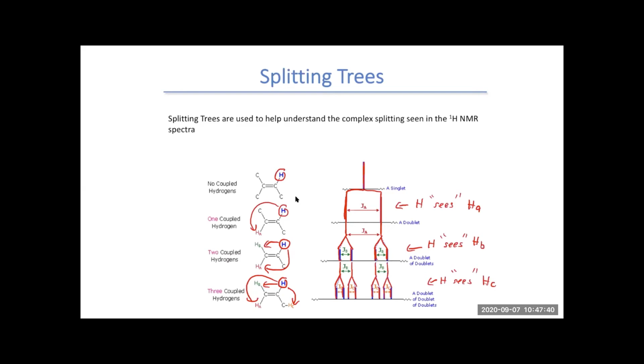So when we look at an NMR spectrum and what the peaks would look like for this, we know if it's not coupling, we get a singlet. If it couples, we get the doublet. If we get another coupling, we get the double doublet. That's four peaks that are all about the same height, and we designate that DD for double doublet.